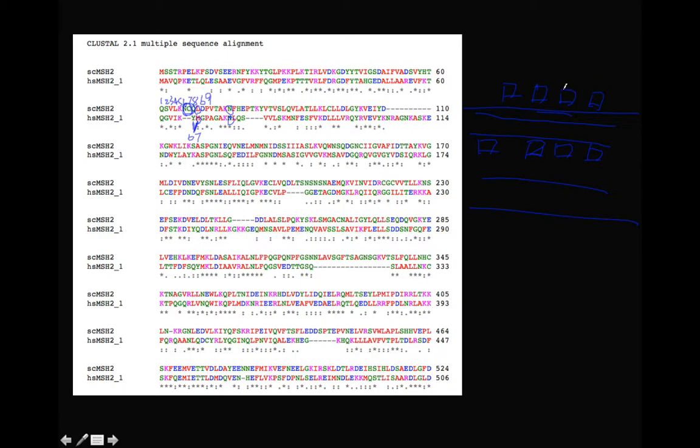Let's say in each street there is one red house. It's actually blue, sorry. But their numbering may not be the same. Let's say this one is 1502, this one is 1504. In this street it is 2002, this is 2004. So these two houses we can call cognate sites, but their numbering is not the same.